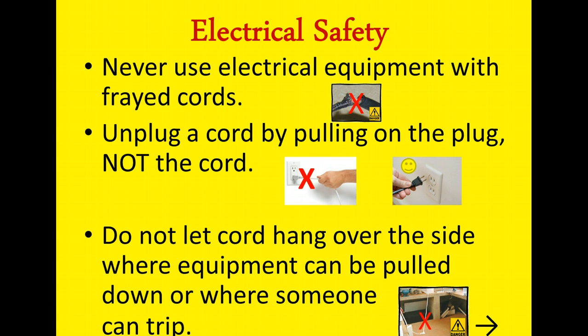And then please do not let the cord hang over the side where equipment can be pulled down, or where someone can trip over it. Okay, so we don't want to have cords hanging down like this or along the floor here. Now there are some cords behind my desk, so that's why it's important that you do not go behind my desk when you leave the classroom. Always go in front, so that you're not tripping over any of that. The overhead cord is there, and there may be some other cord there, and if you trip over it, some very expensive equipment is going to fall to the floor. So always go in front of my desk, please, and not behind.